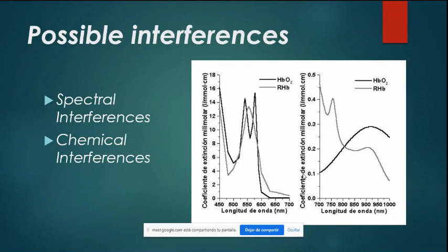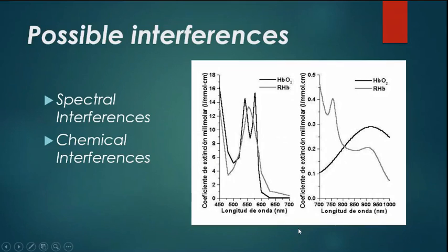Nowadays, there is evidence of processes carried out in the flame that approximate to thermodynamic equilibriums: the dissolutions, ionizations, and slightly volatile compound formation equilibriums are the most interesting.